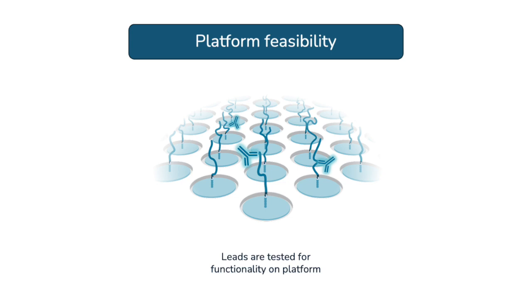The next step we take is we also do a number of kinetics steps. We use techniques like biolayer interferometry or SPR, surface plasmon resonance, to characterize what is the binding strength, what are the KDs, what are the on rates and off rates of each probe. We also test it on our platform itself to understand how well it binds to our protein that's been presented on our nanoparticle. We also characterize how much it binds to off-target areas of the flow cell. Does it bind to the areas where there are no proteins? Hopefully not, and we validate that that's true.